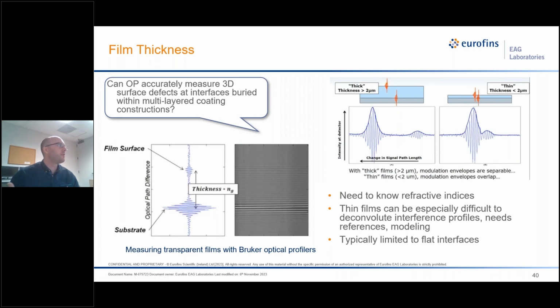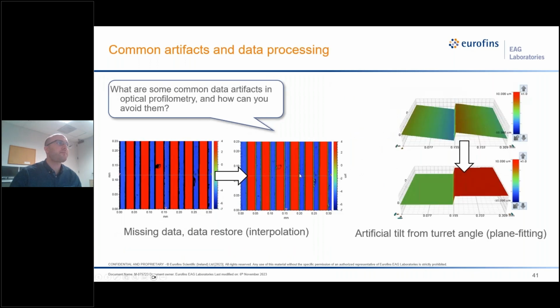You need a reference material of a known thickness of the same type, and you need some modeling to really figure it out.